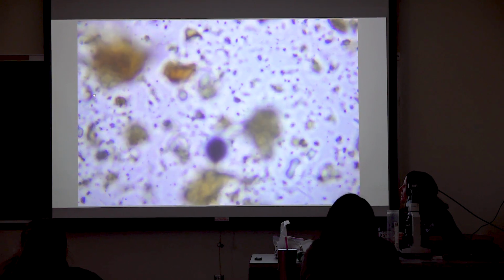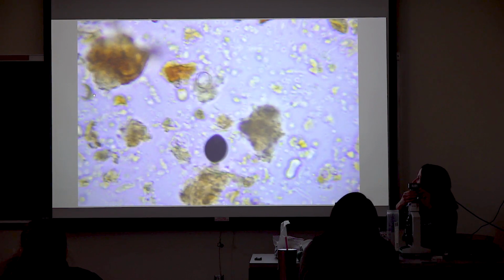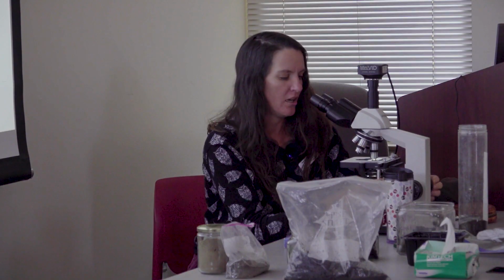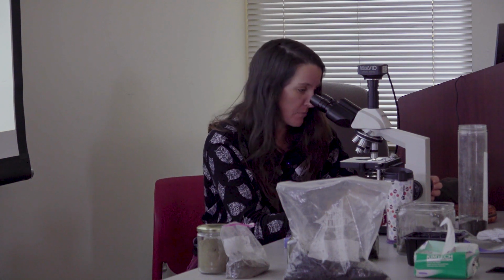Oh, here, let's look at that guy, down in the left corner. I wish we had better resolution here. This sample has been sitting for 2 days. Are there things that have died off possibly in the sample? Unlikely that they died. Most likely they went to sleep. It is possible, but also that container has a lot of airspace in it. So likely, since it's just been hanging out, organisms have probably had a chance to wake back up, and I just made them all angry by shaking the crap out of them.